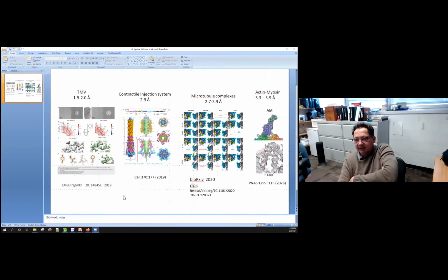In those cases, the natural approach to determine the structure is to take advantage of helical symmetry to solve your specimen. In terms of methodology, it is converging very much toward the single particle approach, but you need to understand what a helical assembly is in order to take advantage of it and get as much resolution as your specimen allows.